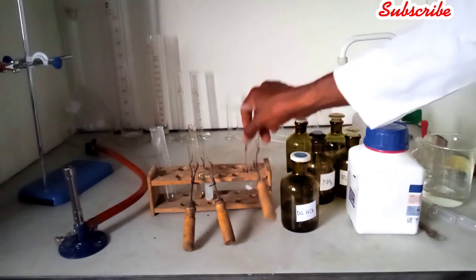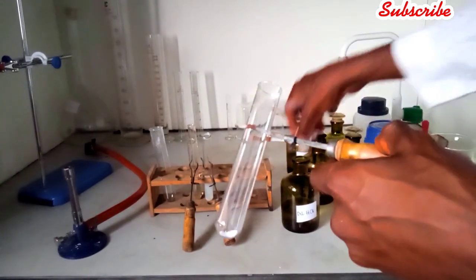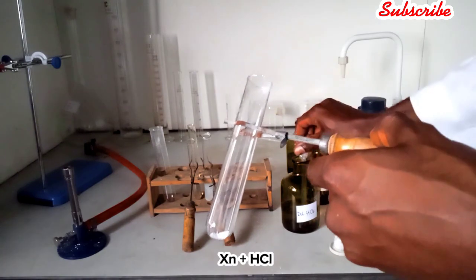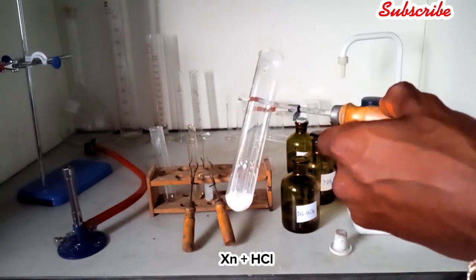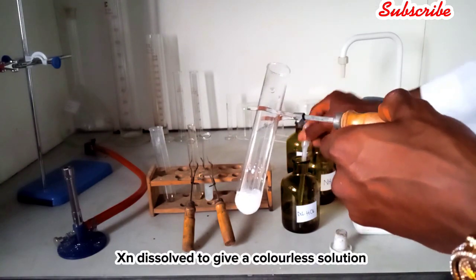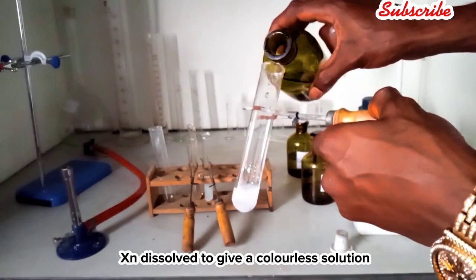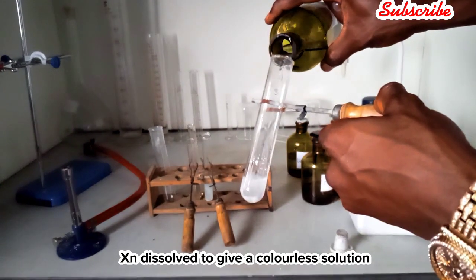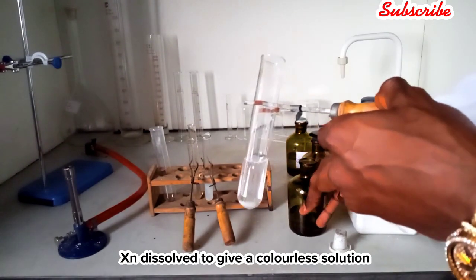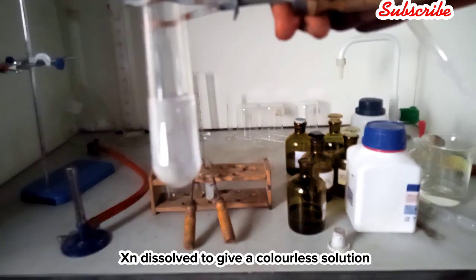So the next one is your Xn, which is zinc carbonate plus HCl. You observe that it dissolves to give a clear solution.